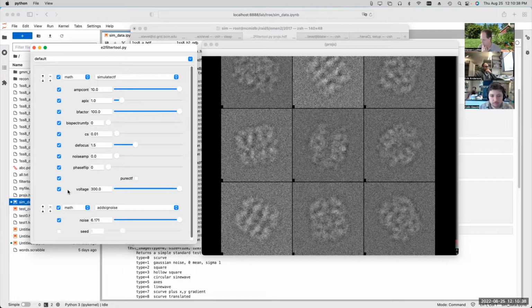No motion. That's a good point. No motion. That's one important thing. Any other ideas? What else might be missing? All right. How about the fact that if you're looking at a real CryoEM image, what's noise in that image? What would you consider noise to be?